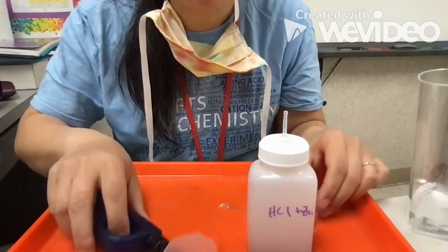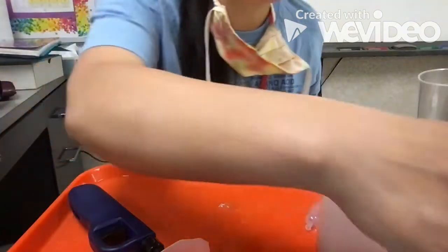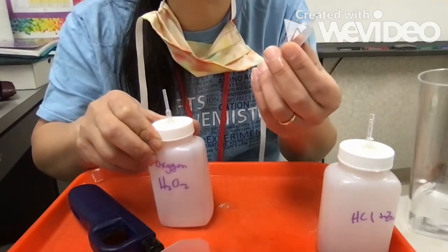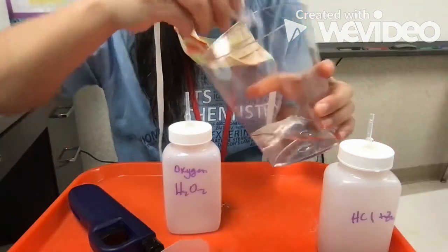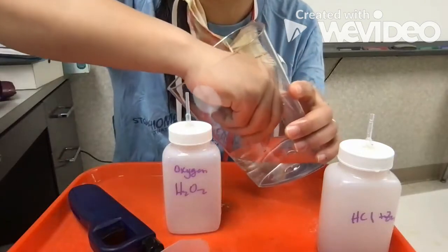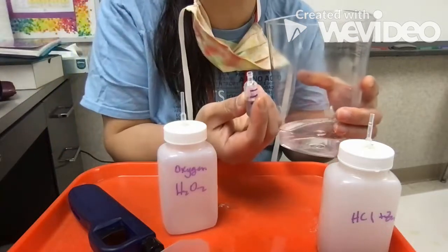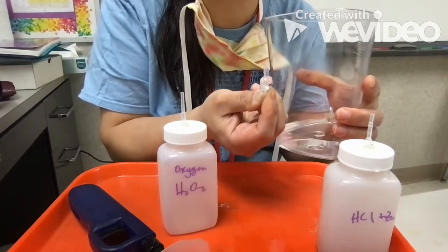And then after you do the hydrogen, you're going to have to make some oxygen and collect a bulb full of oxygen and test that. Okay, so remember to fill up the bulb, squeeze this first, draw up some water by letting it go. Now it's half full. Turn it over, squeeze it again. Do this all over your bin so you don't make a mess on your desk.